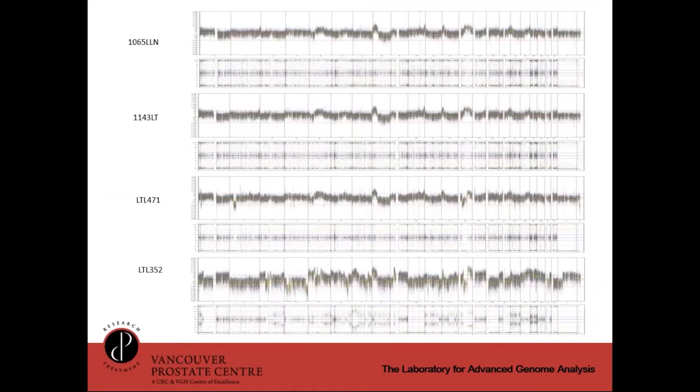So I'm going to look more in detail at these, and here's a few of them. The 3 at the top here kind of look like what we were looking at before. If you can see it, it's essentially flat. It shows the inverse situation that we should be seeing in prostate cancer, which is what you would expect if you were running a flat, benign sample against something that did have tumor content. And then the second big tip-off here is just looking at the B allele frequency. It's basically dead flat right across. We don't see a lot of aberration. We don't see a lot of loss of heterozygosity, and we don't see a lot of allelic imbalances. It's basically 3 straight lines.